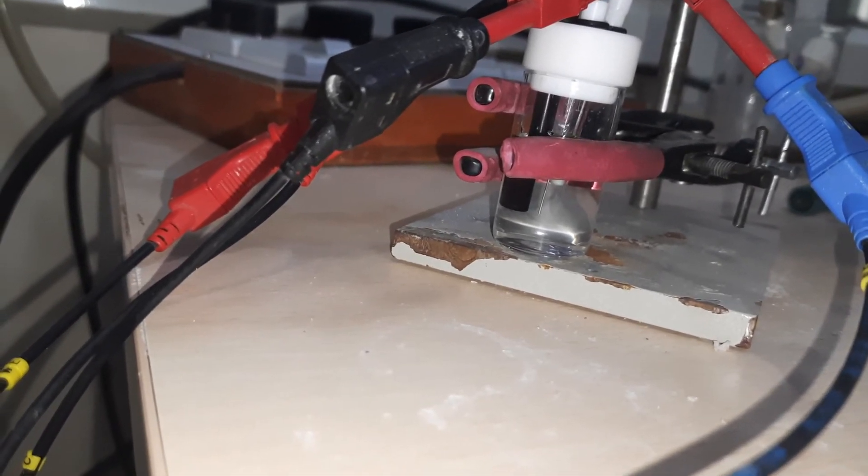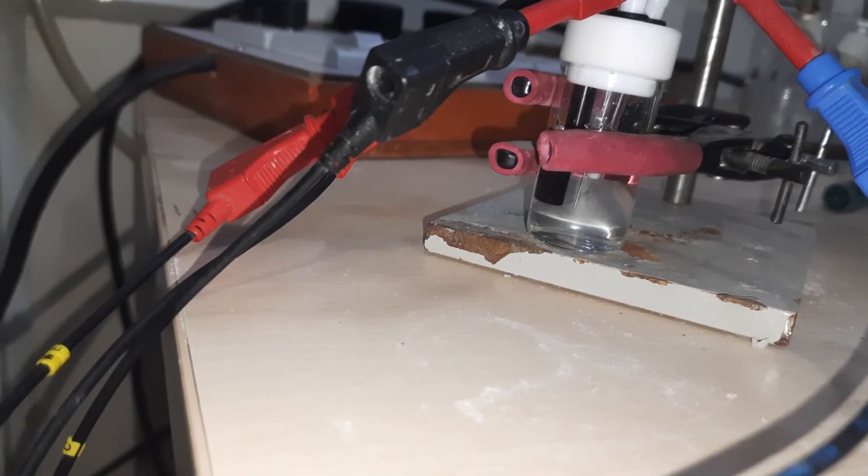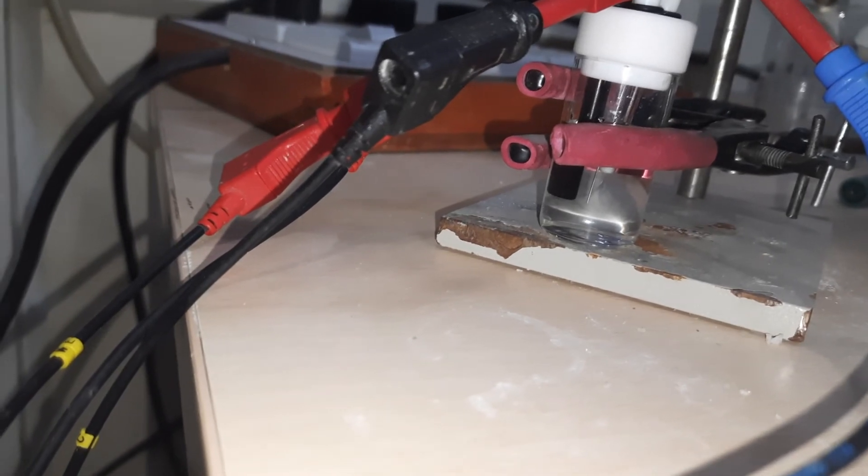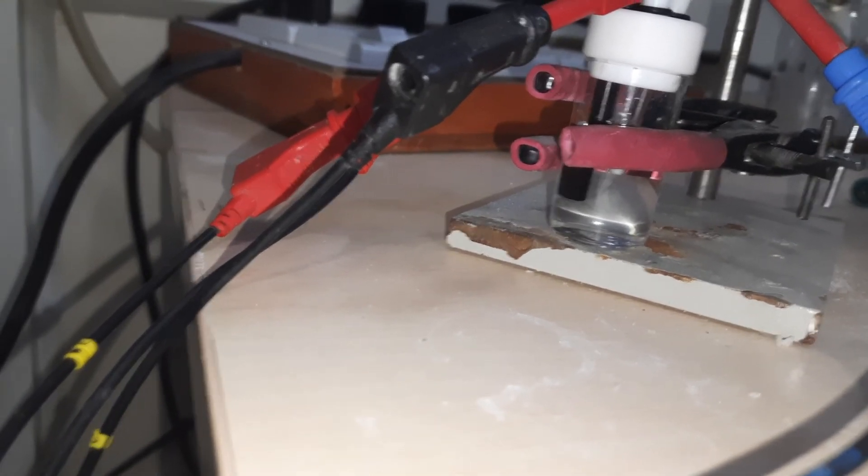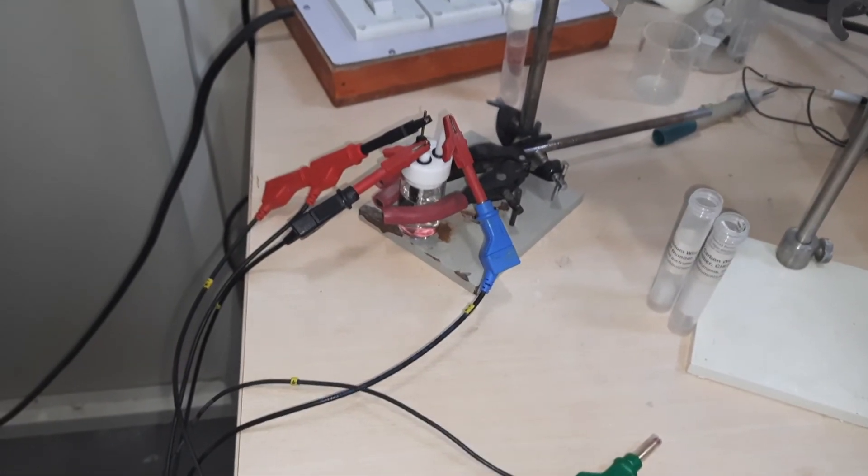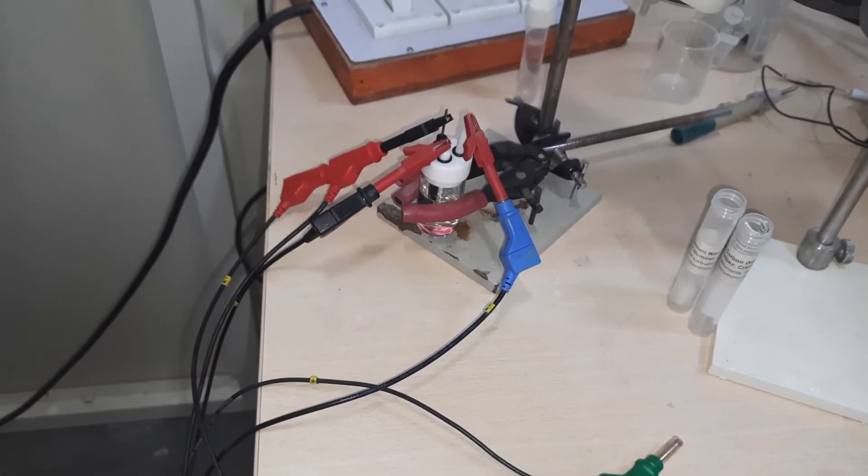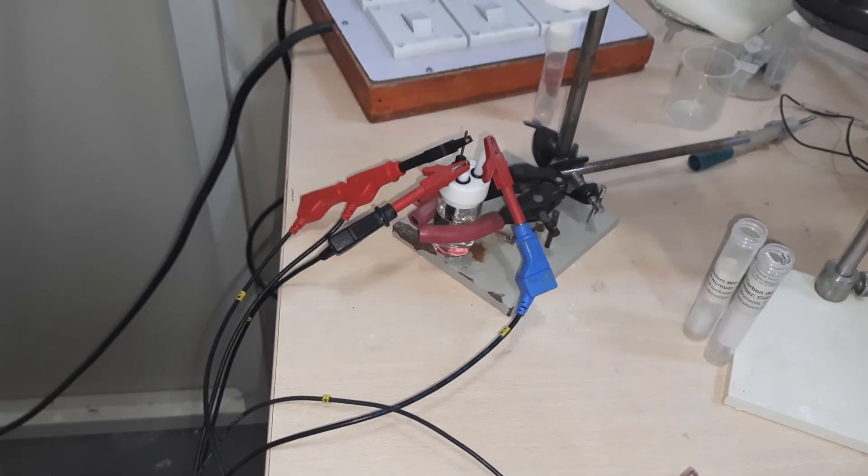They should not be touching each other but should be as close as possible. This is the typical setup for carrying out a cyclic voltammetry experiment. We have only water over here.